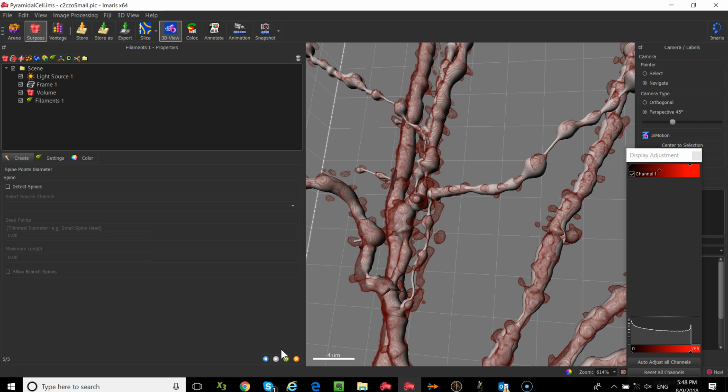For those of you who are looking at dendritic spines, you have to choose one of them and use it consistently, because it will impact your spine calculations if you change it from sample to sample. Okay? Detect spines. Is anyone looking at dendritic spines? We're not going to do this right now, so just forget it. And we're going to hit the finish button.